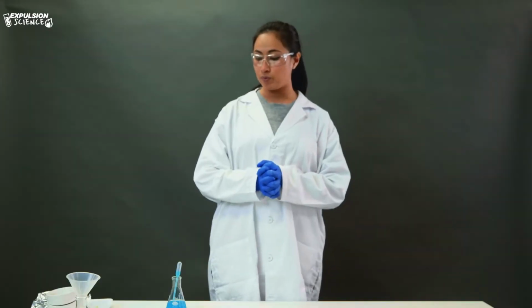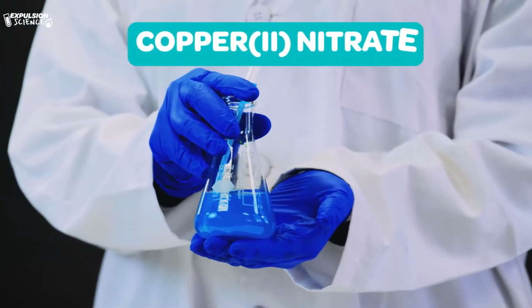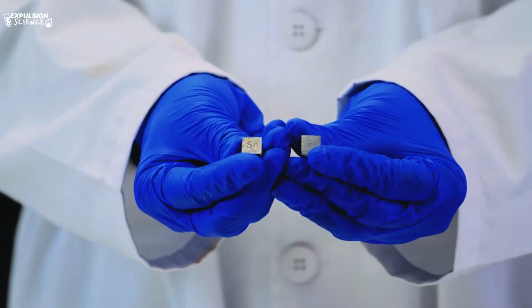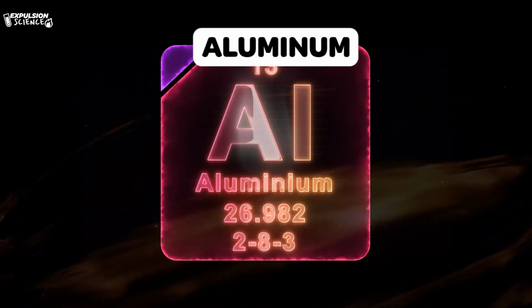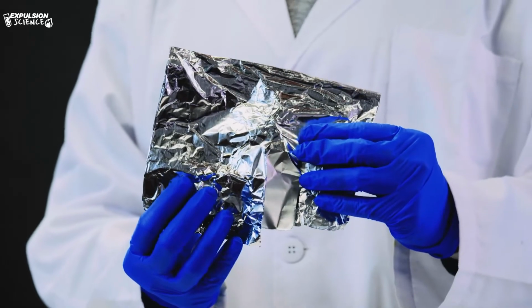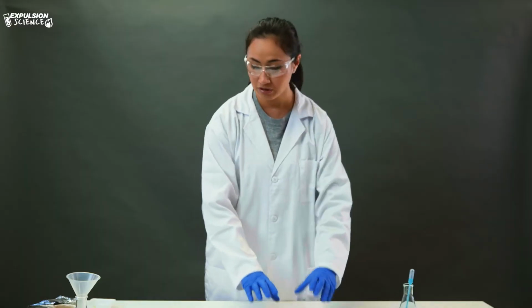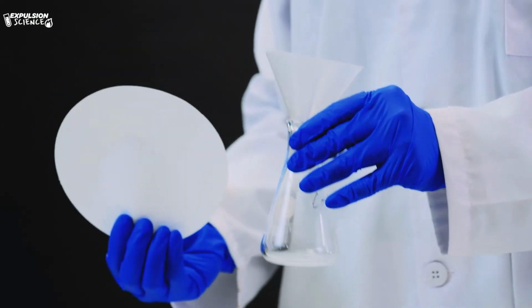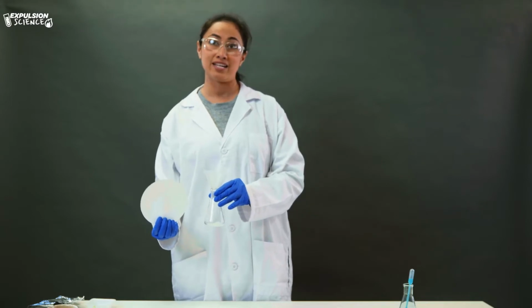For this experiment, we are going to use copper 2 chloride. You may also use copper 2 nitrate. And then we are going to be using 2 different metals today. We're going to be using aluminum and tin. We do have an aluminum block here, but we can also use regular aluminum foil. I'm going to lay out both substances in these 2 small bowls. I also have a filtration set up on the side just in case I want to take this a step further after the reaction has occurred.